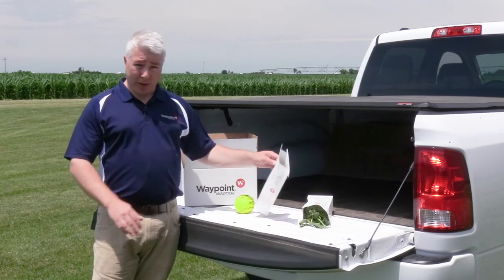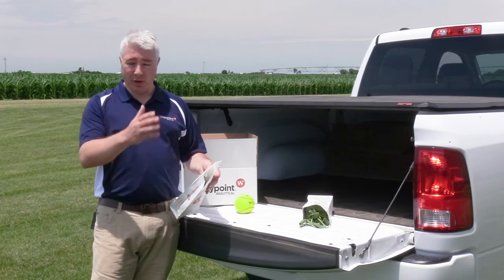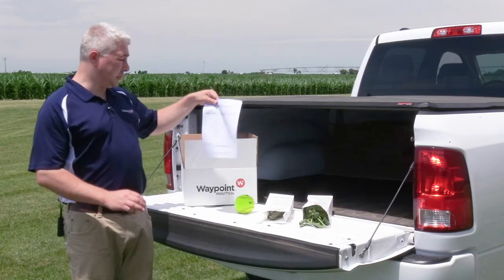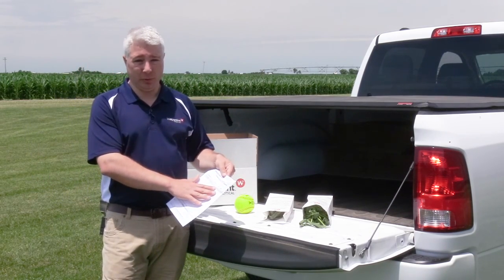So after you have it in your paper bag, you want to make sure it's labeled very clearly and that you understand where each sample came from within your fields. But you also want to make sure that sample matches what you submit on a plant tissue information sheet that you'll send into the lab as well.